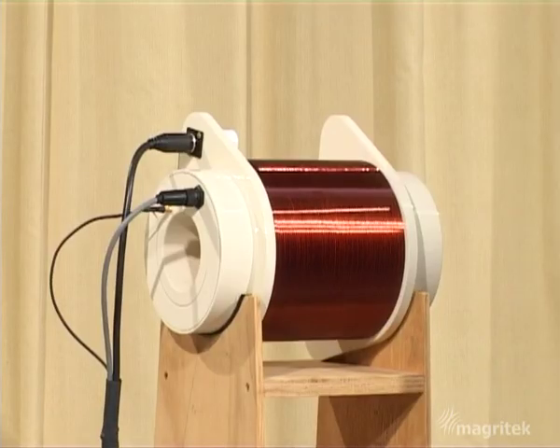Previously, we learned about the basic principles of magnetic resonance using the example of the mechanical resonance of a rotating wheel. And we related that to the idea of atomic nuclei with their magnetism and their angular momentum precessing in a magnetic field. Now we're going to carry out a nuclear magnetic resonance experiment using the Terranova apparatus behind me.